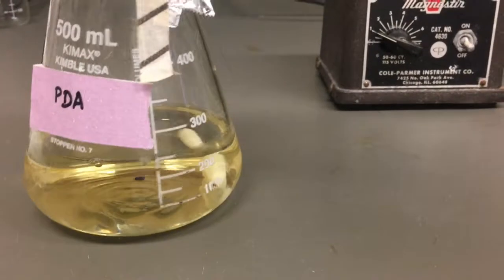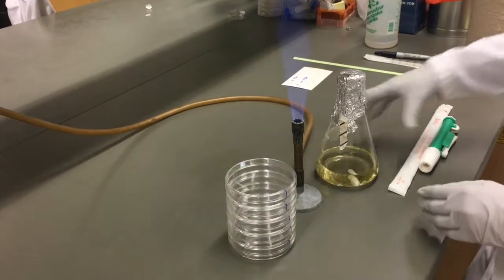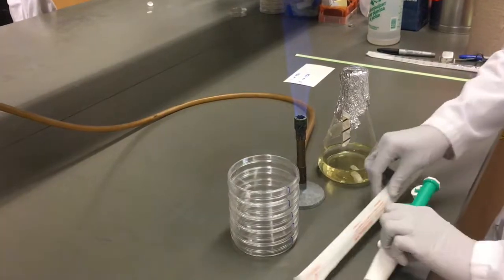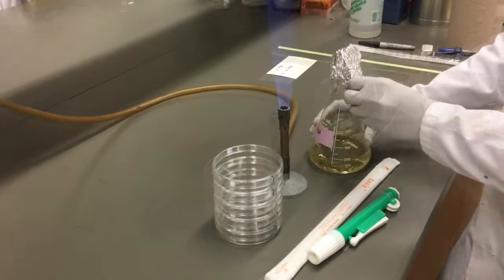Your media now appears clear. To pour any plates on your benchtop, create a zone of sterility with your Bunsen burner. Ensure anything to remain sterile stays within this zone.